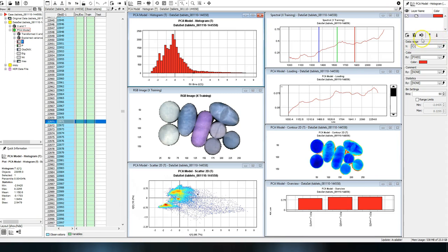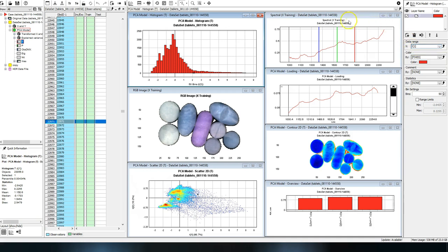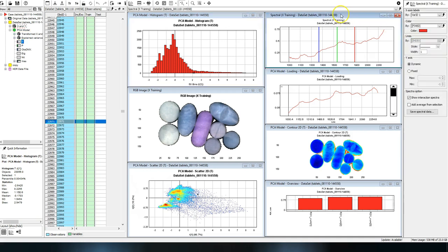In the settings panel on the right side of your screen, you can change the settings for the active plot or image.